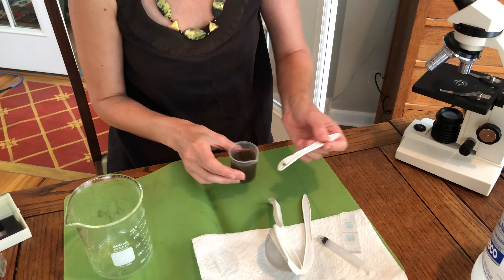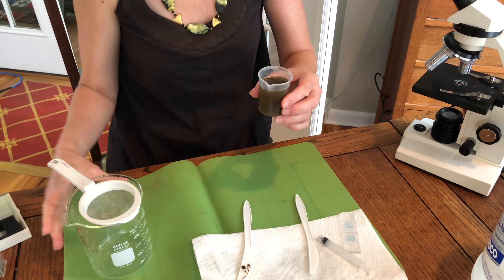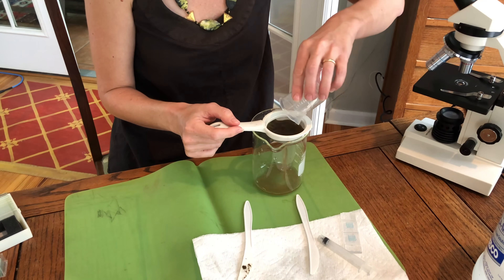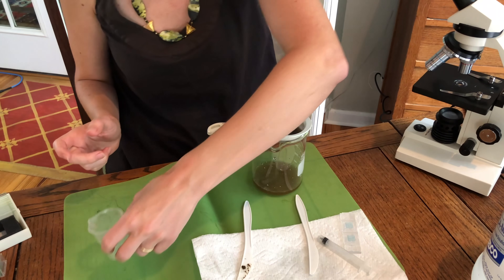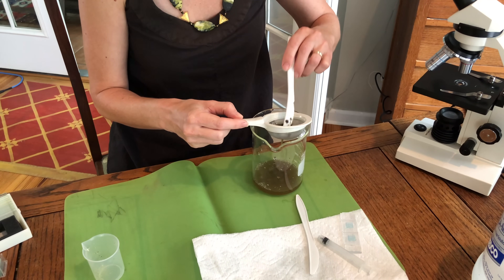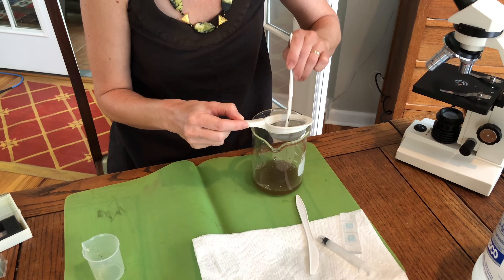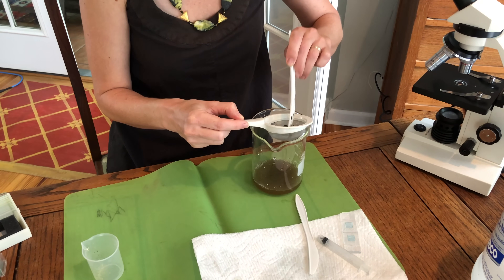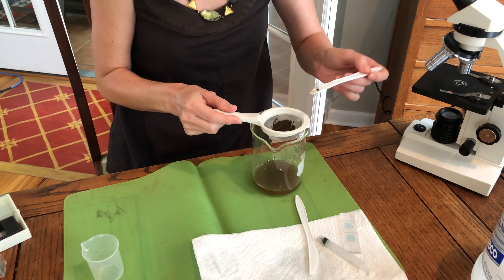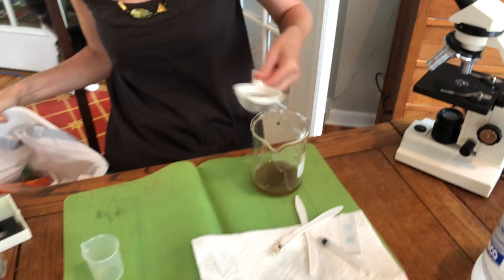Once you've got that, you need to strain this through your sieve into your beaker. Now this is the part where you have to work a little fast. The worm eggs are going to float — hence the flotation solution — so you don't want to give them time to float before you get your sample. Get it all strained out and set the sieve aside.